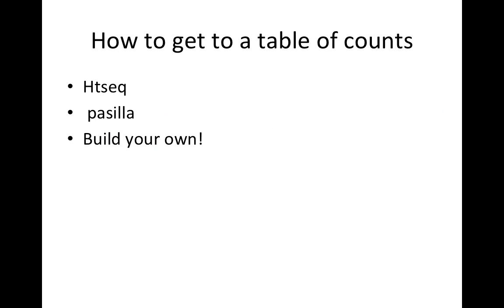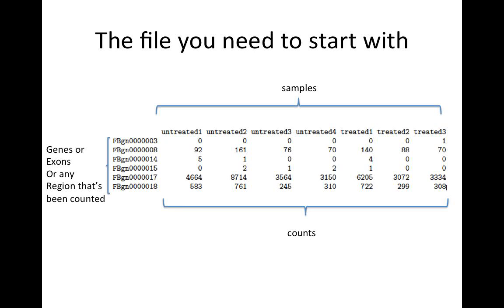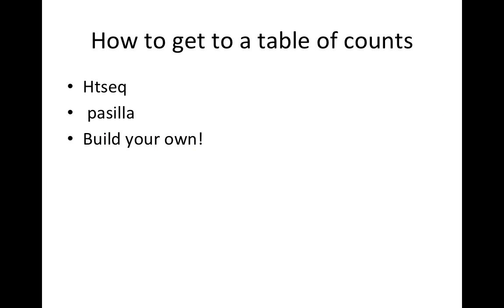HTSeq and Pasilla are apparently two options. However, I've built my own program to basically take a BAM file and count the reads using bedtools, and then build a table that can then be inputted into DESeq. So you're going to have to find a way to get to this table before you start. But for the class, I'm going to give you one of these tables.